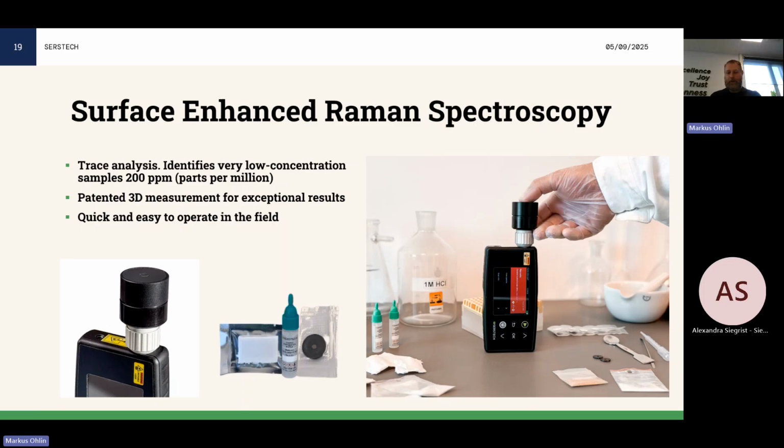So then you shift the balance between the fluorescence and the Raman signal to a more advantageous situation. And to our knowledge, there is no SERS technique with 1064. So these SERS surfaces that we use are only available for 785. So that's another strong argument why we keep using the 785 nanometer laser.